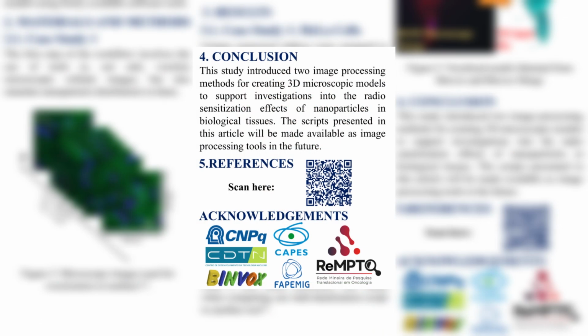So this study introduced two image processing methods for creating 3D microscopic models to support investigations into radiosensitization effects of nanoparticles in biological tissues. The scripts presented in this article will be made available as image processing tools in the future.